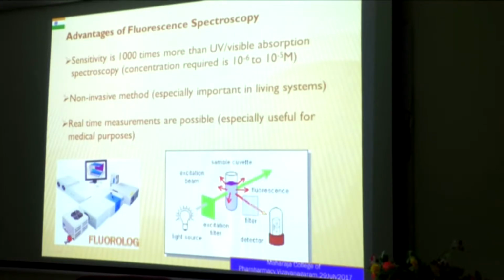I do have quite a few slides where the luminescence technique is being applied for medical and day-to-day assays. When you are not well, you go to a doctor, and he will be using a luminescence assay. How he is using it, I will show you afterward. So this is about the instrumentation.